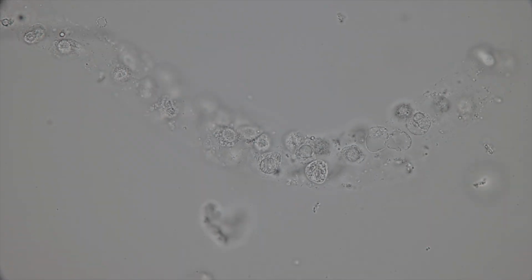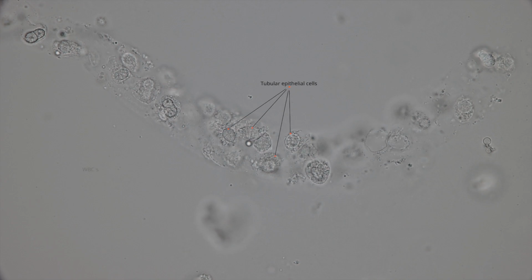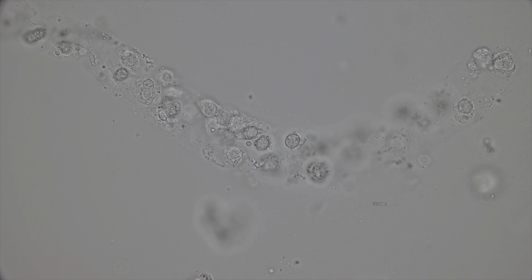Now focusing up and down in a different section, we can clearly see these large eccentric nuclei, which are tubular epithelial cells, and the segmented nuclei, which are white blood cells, and then the red cells, which have a very smooth homogeneous cytoplasm.